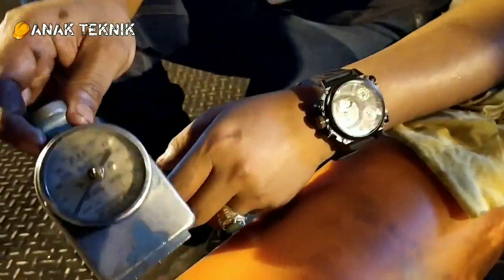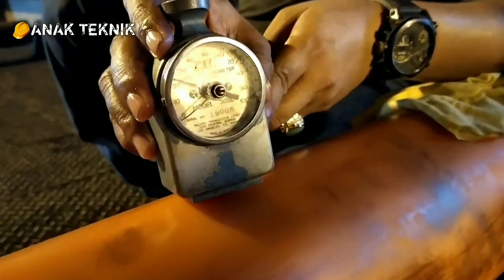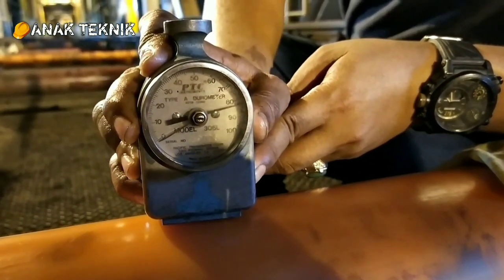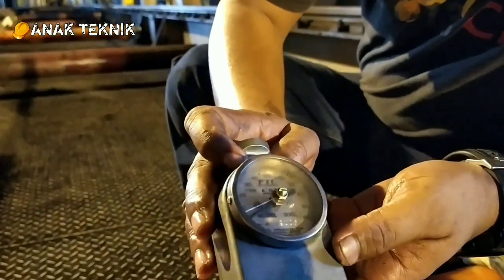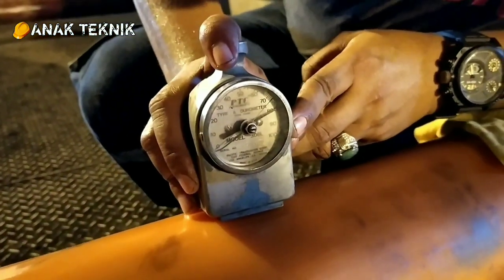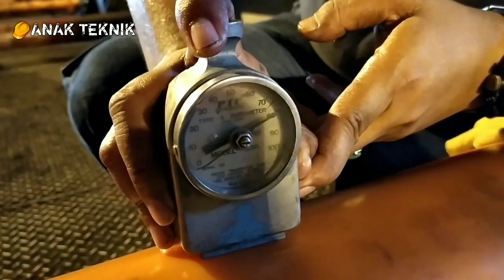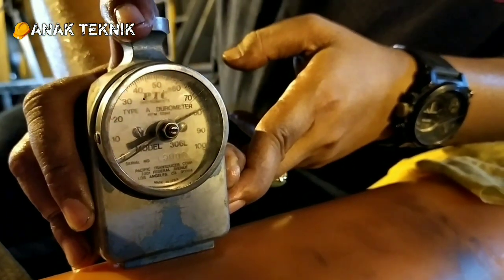Mari kita coba. Kita tekan dengan tenaga dan ditahan selama kurang lebih 5 detik untuk mendapatkan hasil yang akurat. Sudah ada 5 detik sepertinya. Nilainya ada di sekitar 85, 83-85. Artinya kekerasan dari poliuretan ini adalah 85 Shore A.